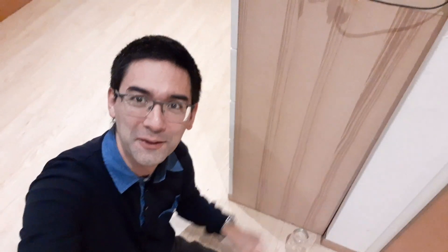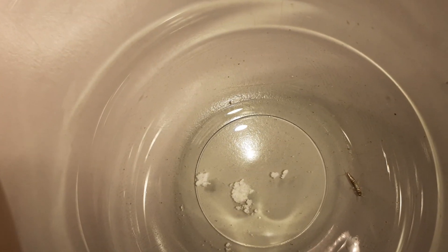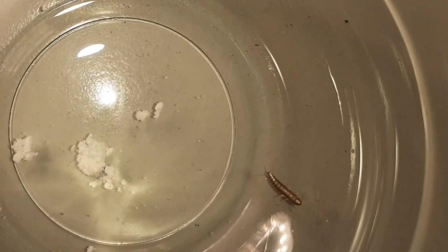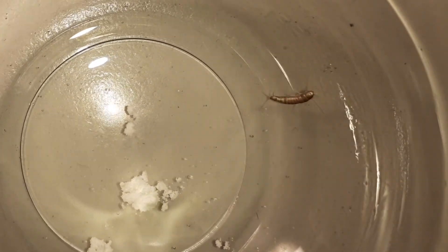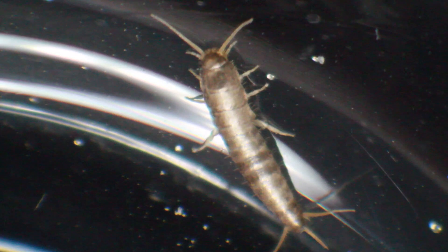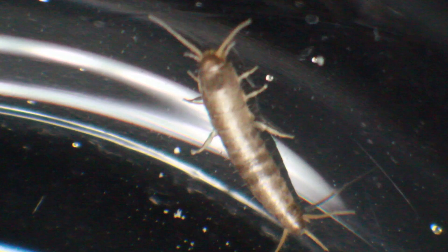Today I consider myself quite lucky - I found another silverfish! Here it is. I put a cup over it, and here you can see it running. I put it into another cup, and the white powdery stuff you see is starch - I tried to feed it a little bit. It's trying to run out of the glass, but not very successful - the walls are simply too smooth. Now you can see this silverfish much better.